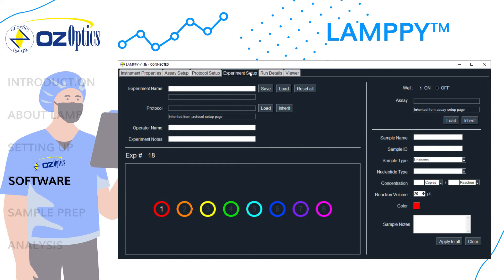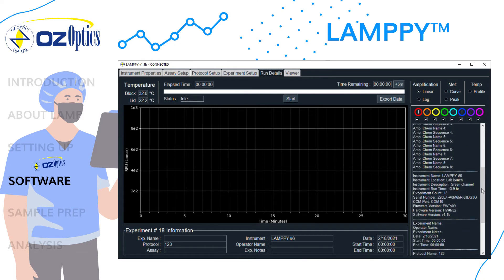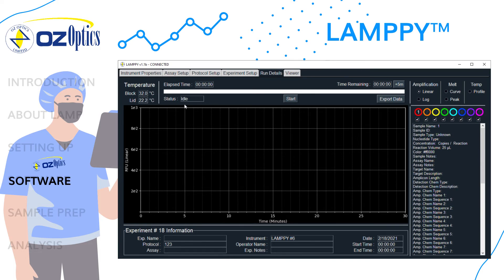On the experiment tab, information about the experiment can be input but is not required. Experimental setups can be saved and loaded. On the bottom left of the screen is the well map which can be used to edit each well's information. On the right hand side, you will see the well information in the input fields. Wells can be enabled or disabled and individual assays can be applied to each well if needed. Once setup is complete, you can select the run details tab, where you can check that the input information is correct. The temperature of the block and lid, the status of the instrument, the elapsed time, and the time remaining are displayed at the top. You can also add additional time to the experiment, start and stop the run, and export data using the designated buttons.